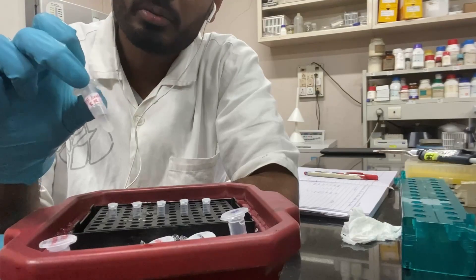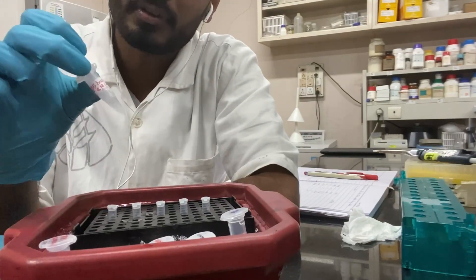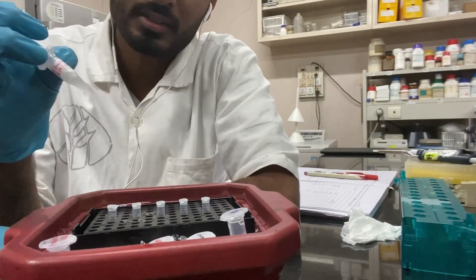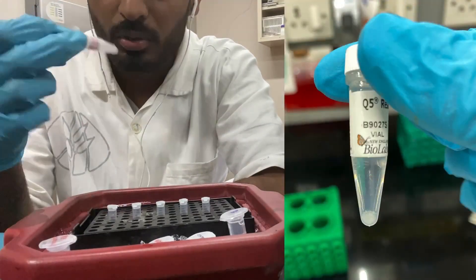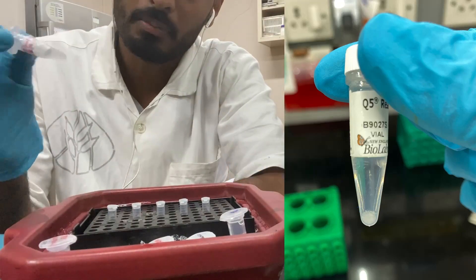One thing I want to mention about the buffer: after thawing, every time you have to vortex the buffer because there may be chances that the salts used in the buffer can precipitate. So we have to vortex it to mix the buffer properly.